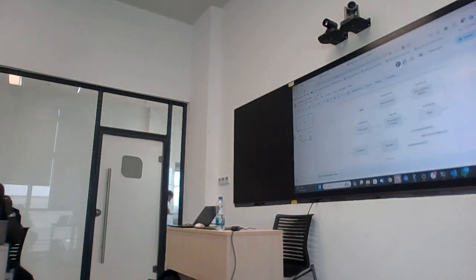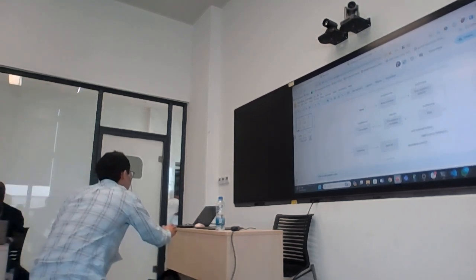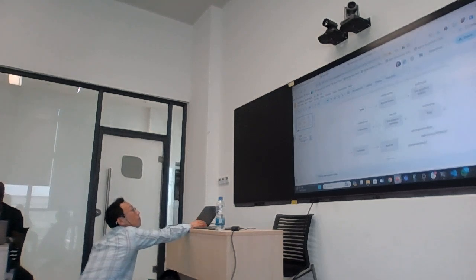And when we call variants, using different tools to call variants, there is this slide. It is shared with you on the WhatsApp event. I think that I'll share it again. Share it again, please, Kirsty. If you don't need to take photos, okay? I just want to take it with me.